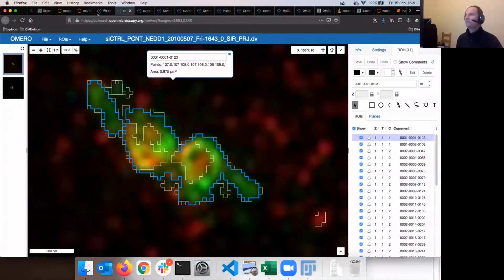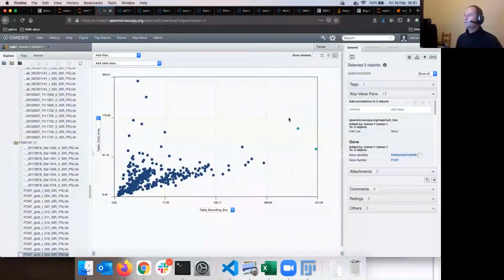And the way we came to that is by seeing those two images being suspiciously too far to the right in this graph. So you just see the power of OMERO.parade like that, where I used it as a quality control tool. I can now inspect basically the quality of my segmentations, which were done automatically in Fiji. This segmentation was done exactly with the same walkthrough as I was showing to you before the break in Fiji with the analyze particles, etc. So this is one thing.